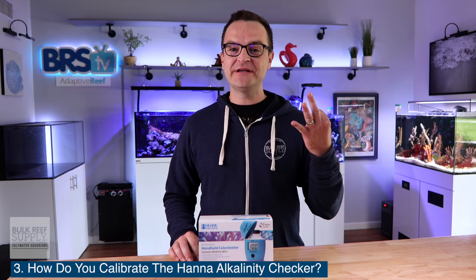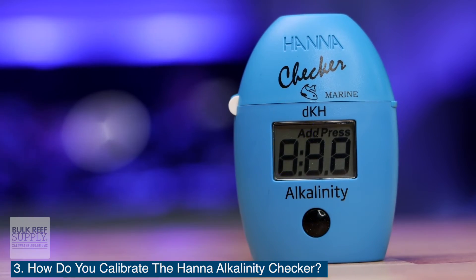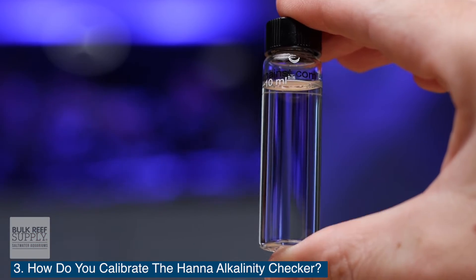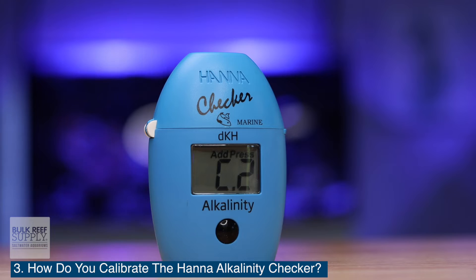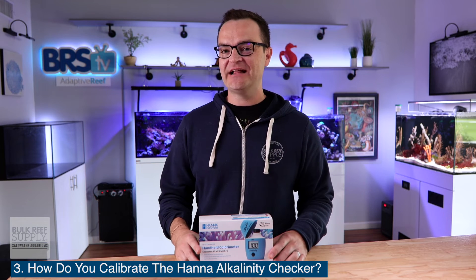Question number three: how do you calibrate the Hanna Alkalinity Checker? That part's really easy because we actually walked you through the calibration during our answer to question one. Since the Hanna checker needs to be calibrated before each use, it's just automatically built into the instructions. So when you put 10 milliliters of tank water into the cuvette and the Hanna checker read C1, you were actually calibrating it.